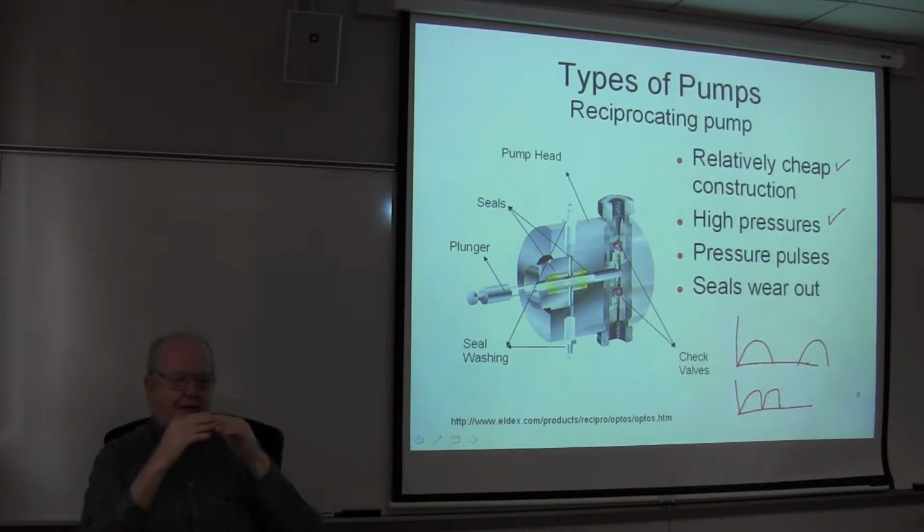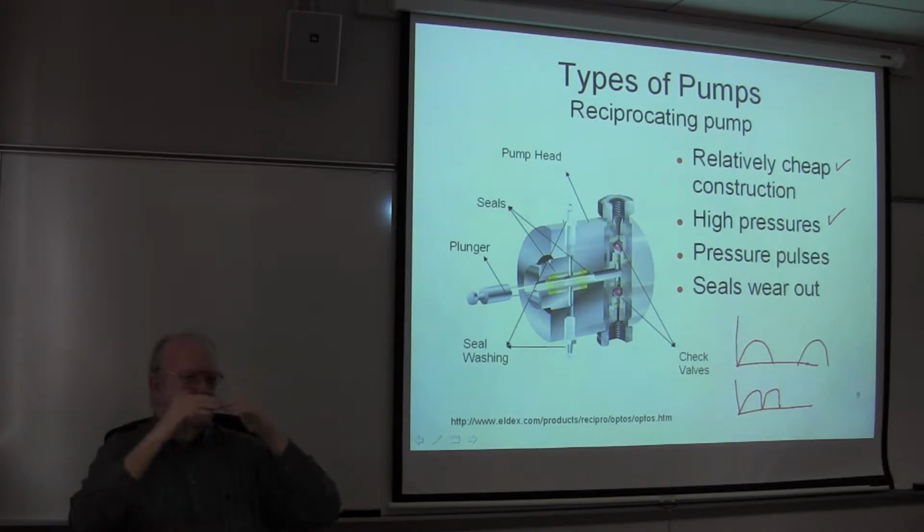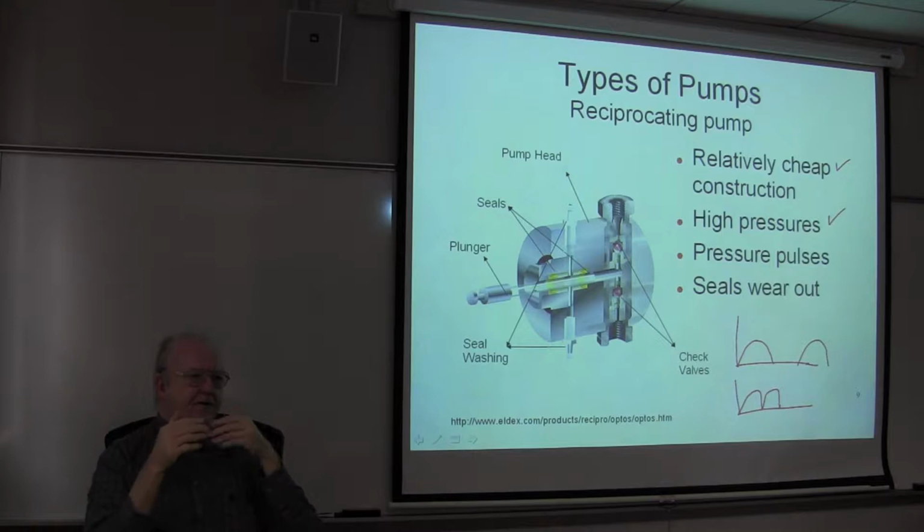And you overlap those pressure cycles to essentially create an interference pattern that wipes out that pressure dip. Now you can never make that perfect, so they will follow up the pair of pumps with a pulse dampener.